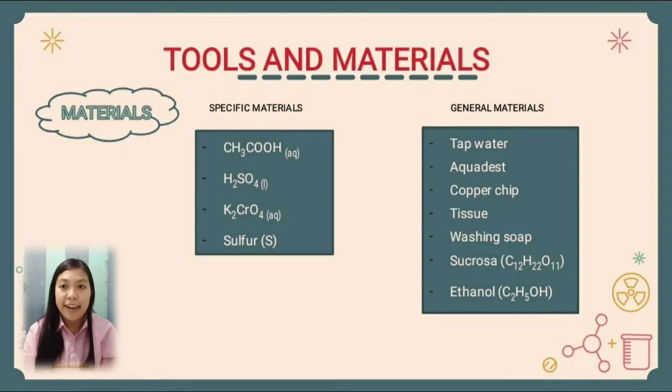And the materials. Specific materials: CH3COOH, H2SO4, K2CrO4, sulfur. And general materials: tap water, aquadest, copper chip, tissue, washing soap, sucrose, and ethanol.